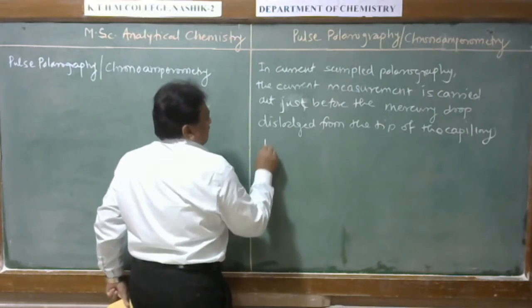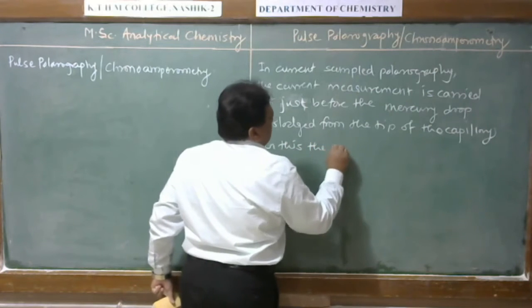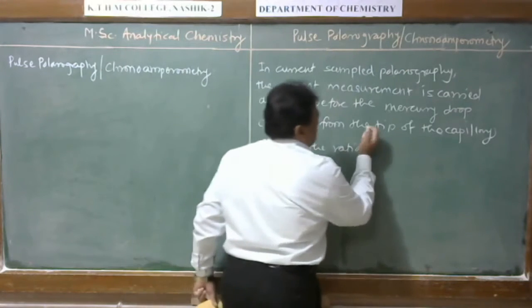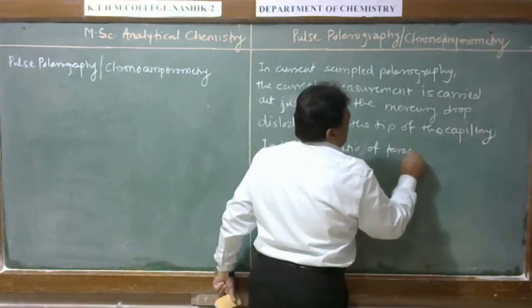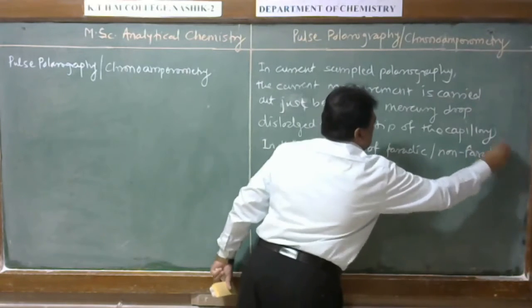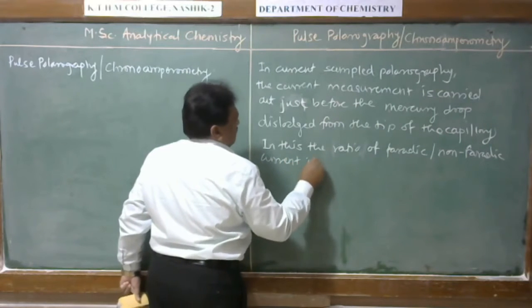In this case, the ratio of faradic to non-faradic current is optimized.